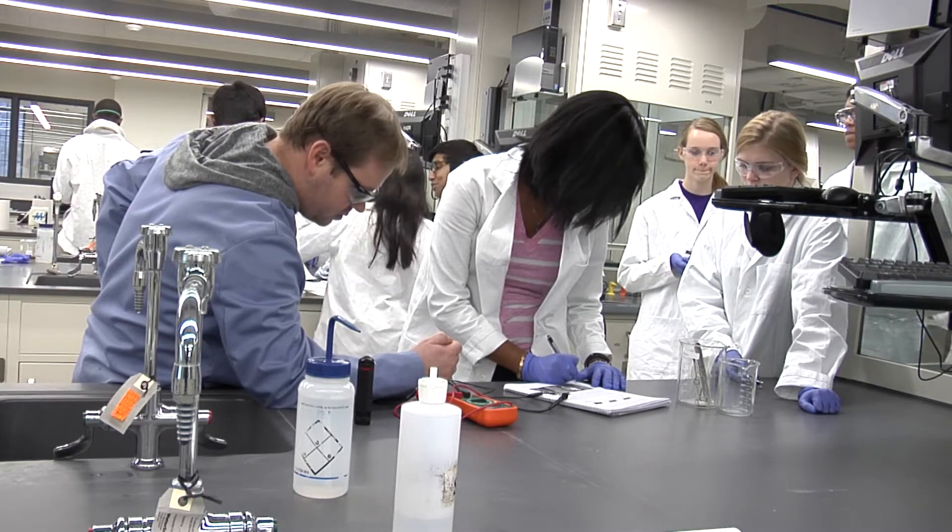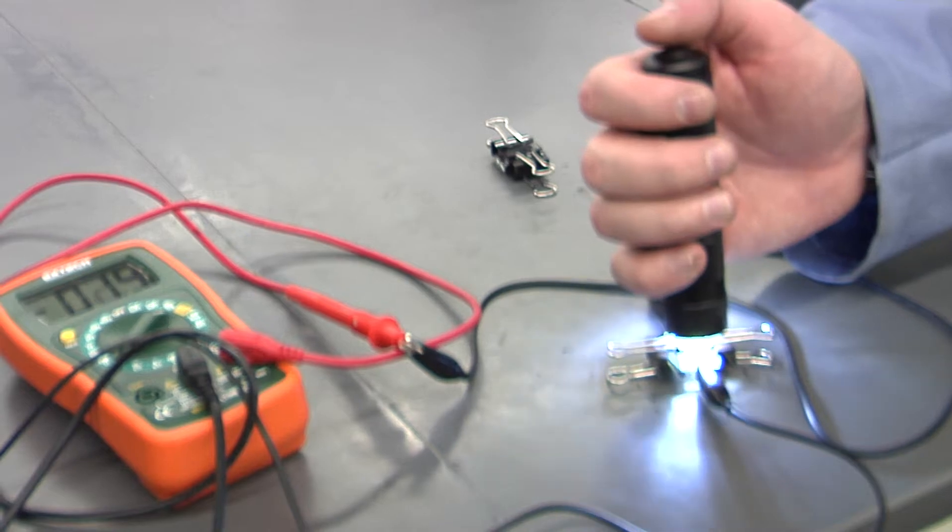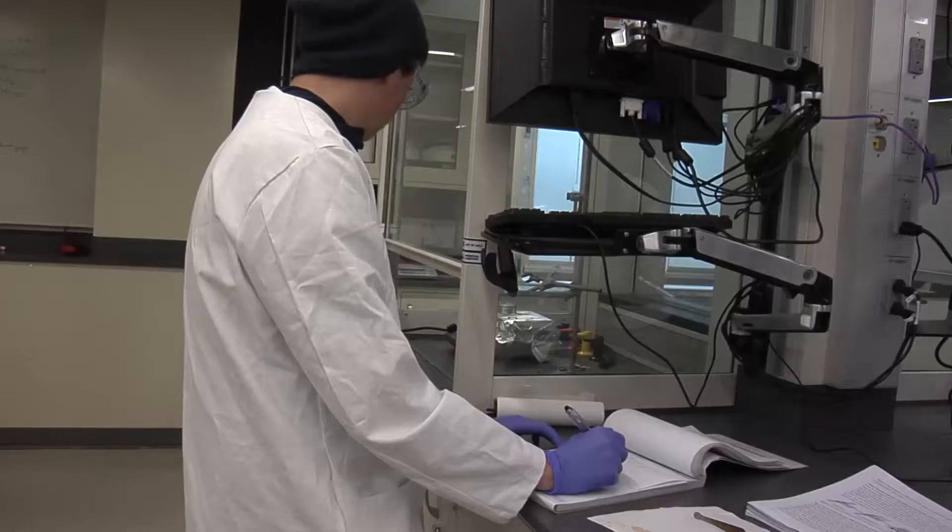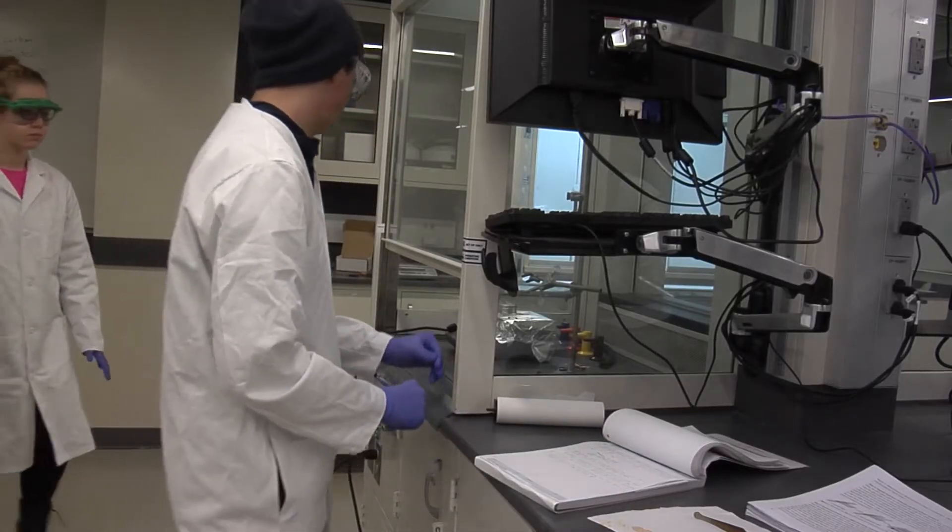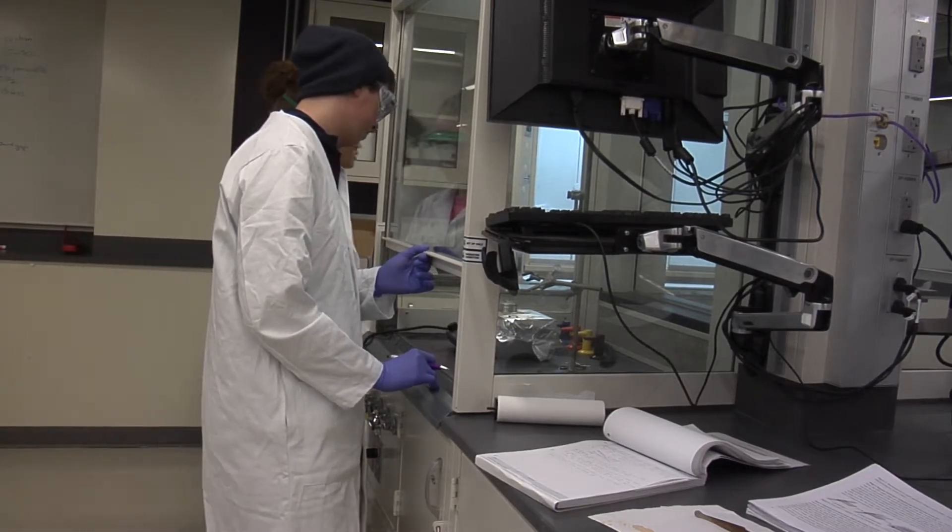Students in Northwestern's freshman chemistry lab are cooking up something powerful this Friday afternoon. They are pioneering a technique for creating solar cells in only two hours. Postdoctoral research fellow Samir Patwardham developed the recipe.